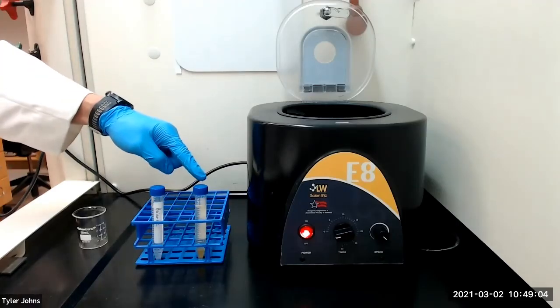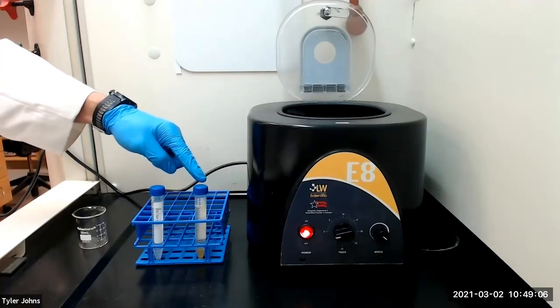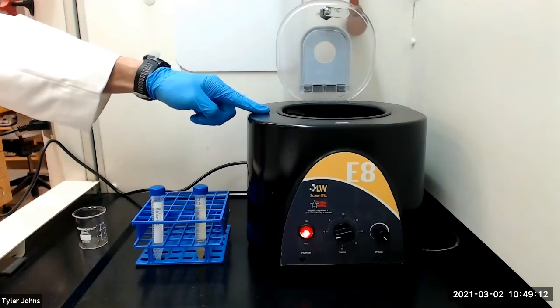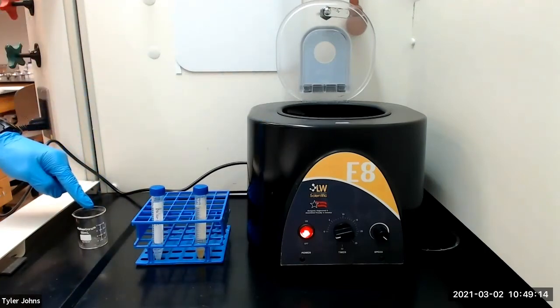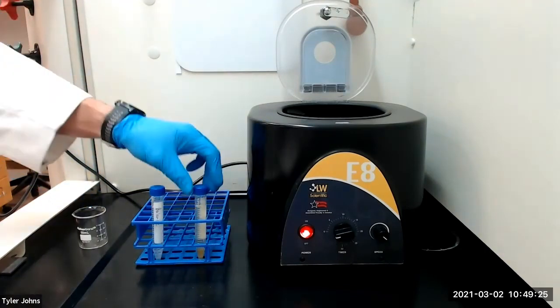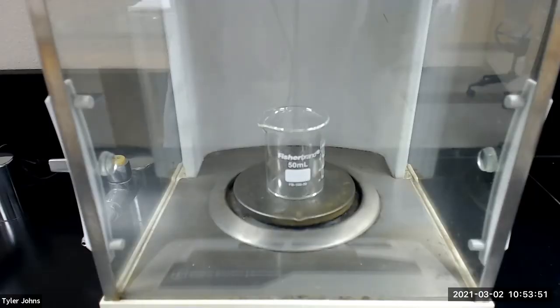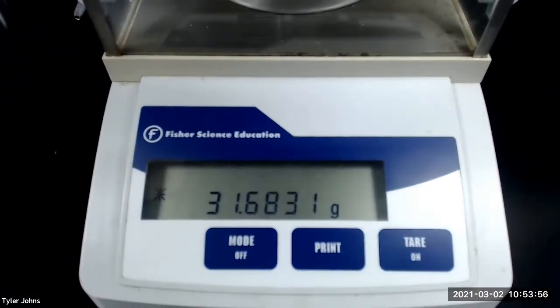After 15 minutes, we will next separate the layers more completely by centrifuging the mixture for an additional 5 minutes. And while the mixture centrifuges, we need to pre-weigh a 50 milliliter beaker. The mass of the pre-weighed 50 milliliter beaker is 31.6831 grams.